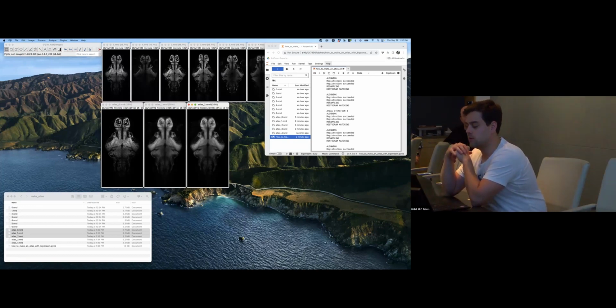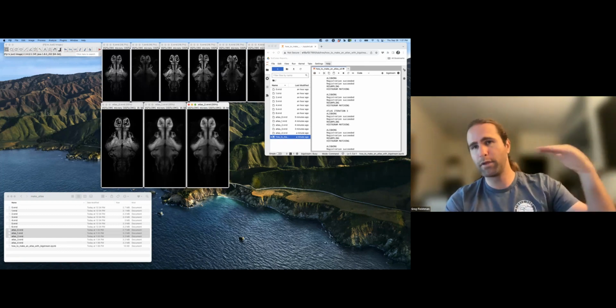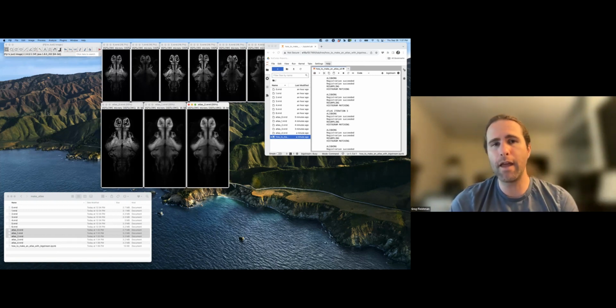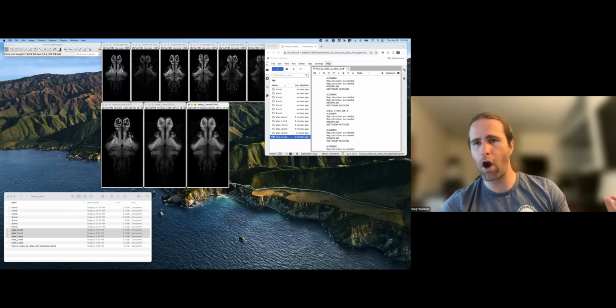Someone asks if it doesn't matter if in 3D images you have different number of planes. No, it does not matter. That's perfectly fine. The thing that matters more than the number of planes in the image or the number of voxels in XY for that matter is that to the greatest extent possible, the same anatomical structures are present image to image. It doesn't really make sense to make an atlas from 4 images of a heart and 2 images of a brain.